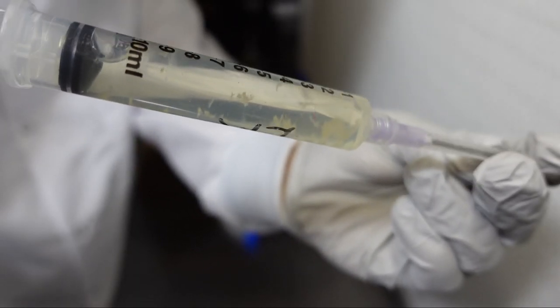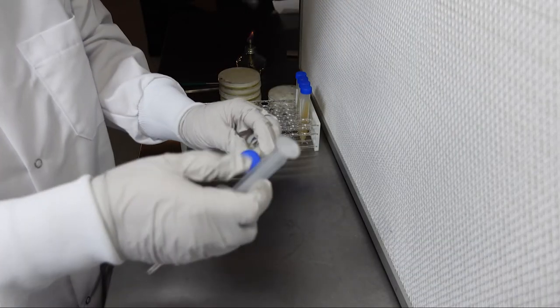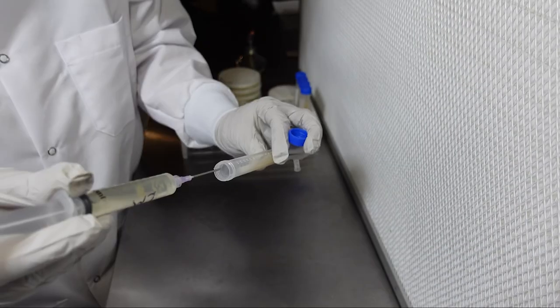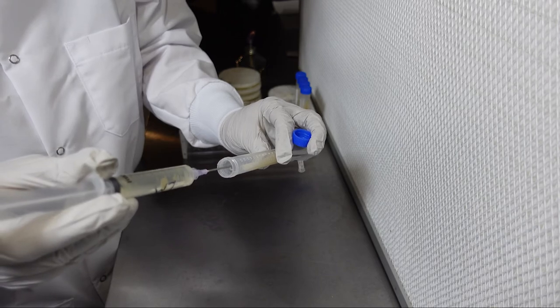You can also inoculate slants with liquid culture by simply flame sterilizing the needle and then squirting just a few drops onto the slant.